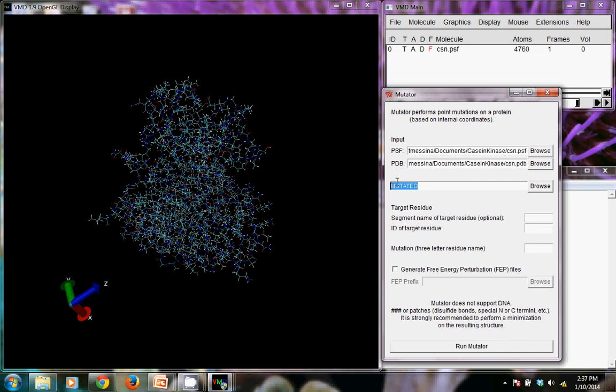And although it doesn't say so, this is the output here where it says mutated. I'm going to change that to CSN so that it has the same sort of labeling we've been using.